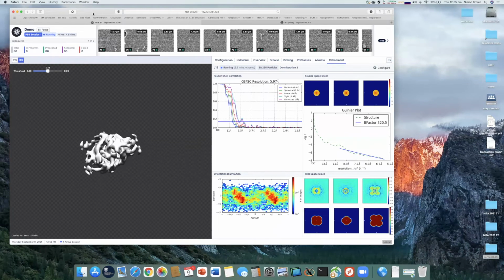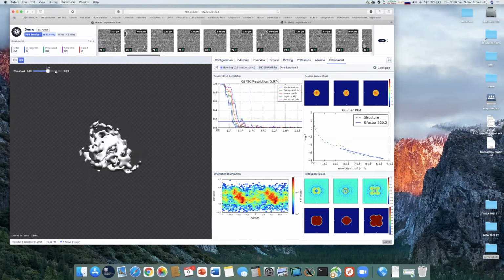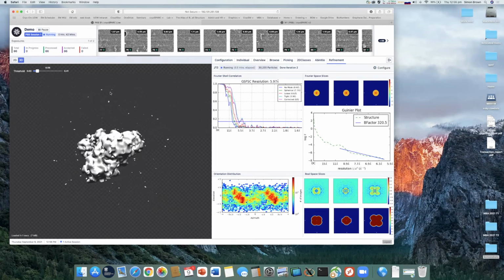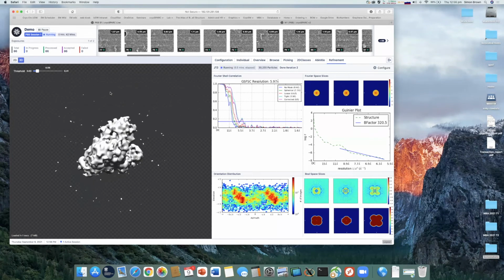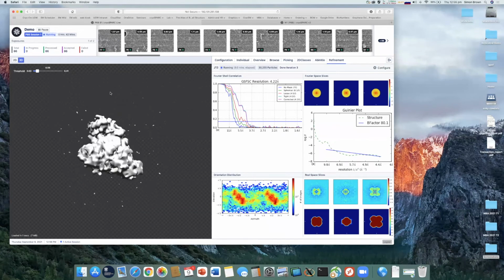You could point out, Simon, that even though we aren't paying for cryoSPARC, you are paying for some support around it, though obviously not from cryoSPARC itself, if other people were interested in that aspect. Well, how about you describe that, Jason, because you know that relationship. Sure. Michael, cryoSPARC is a relatively complex beast, and Simon is not someone who wants to spend his time playing with the software when he'd rather work with the customer. So we actually use Single Particle in the US to provide support around the cryoSPARC package. It's a pretty cost-effective deal.